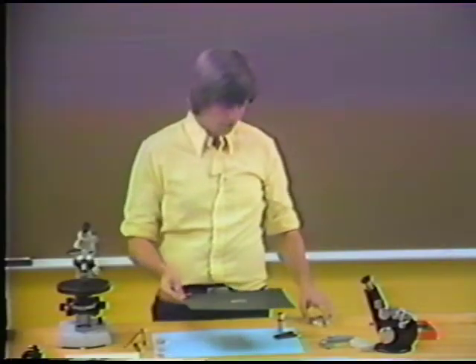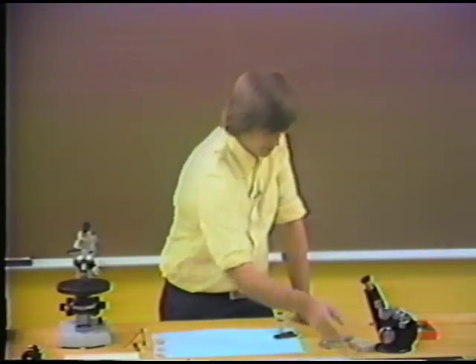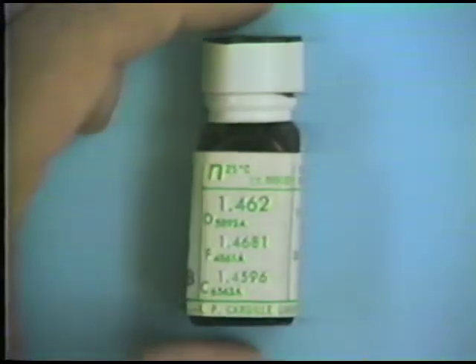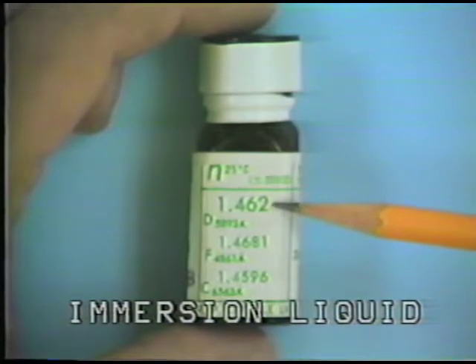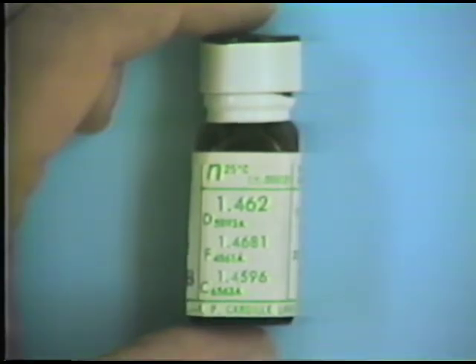I have an example here of a bottle of this immersion liquid. Normally you have a whole fleet of these bottles. Here's our bottle of index of refraction liquid, and you can see that it's labeled right here with a number, 1.462, which represents its index of refraction. There also are some other numbers which correspond to temperature and wavelength corrections of the index of refraction.